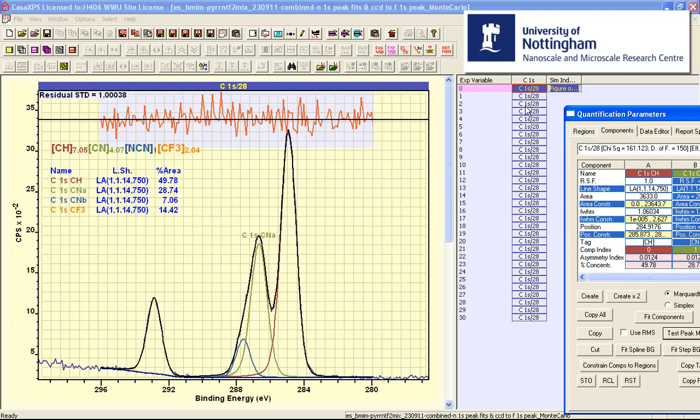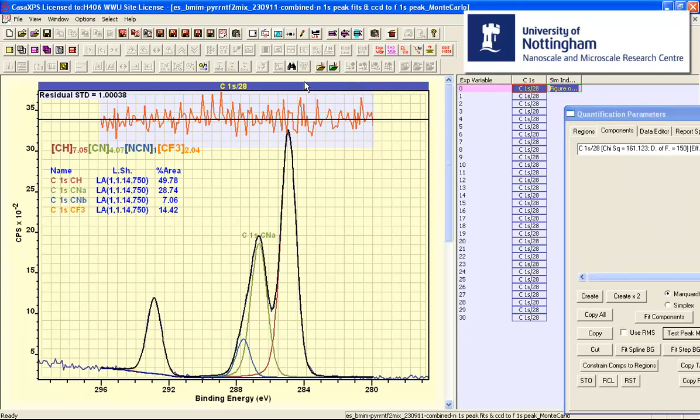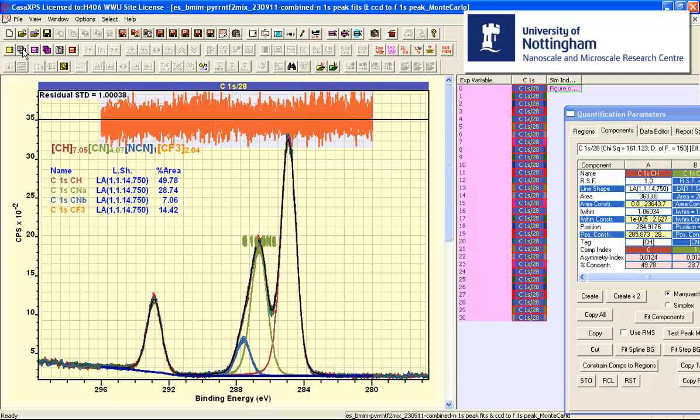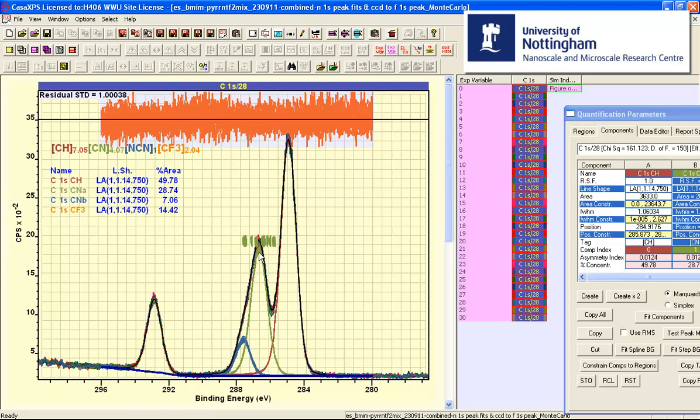I wish to overlay these in the active tile so I will select and overlay at which point we can visually inspect the data and the model.